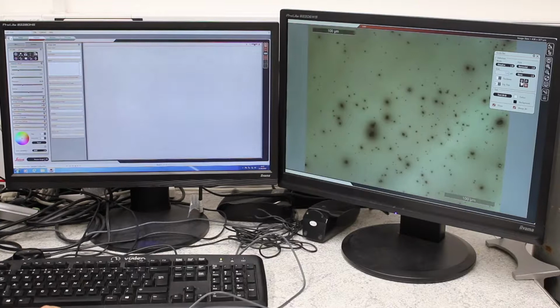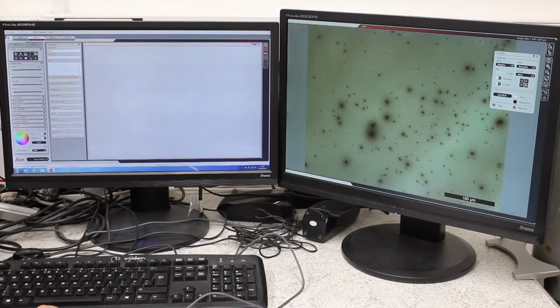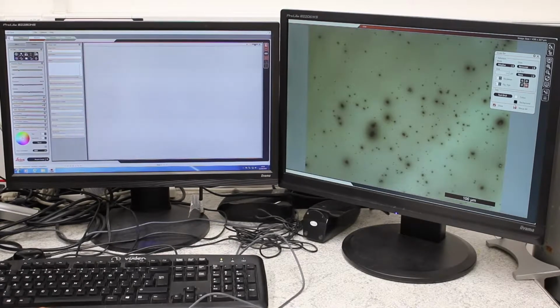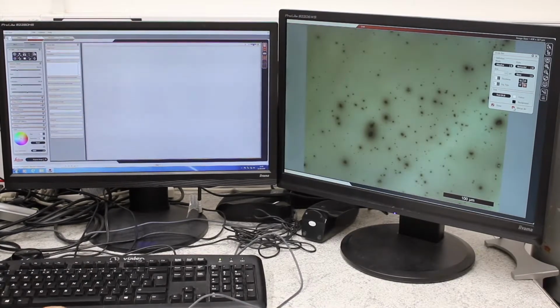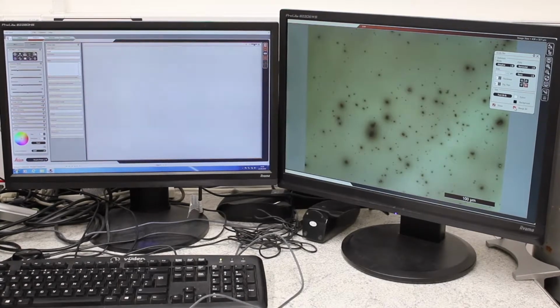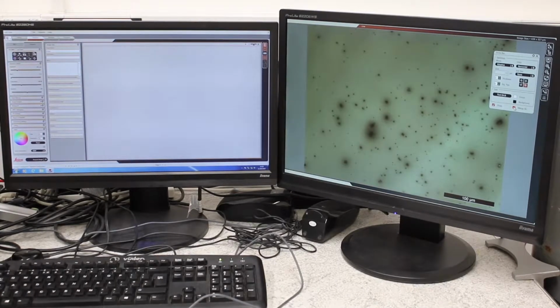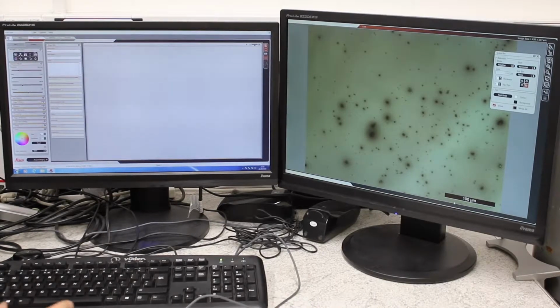And then you can go in scale bar to change the settings of the scale bar. So whether you want it at the top, bottom, what font you want, what thickness, everything, settings, colors, the background color and everything. And you can either tick or untick merge all. If you tick merge all, it means that when you're going to acquire an image, the scale bar will be on the image. But if you want to have all the image without scale bar and add it yourself, like using other programs, you just untick that. The scale bar is still visible on the image, but after acquisition, it will not be on the image.